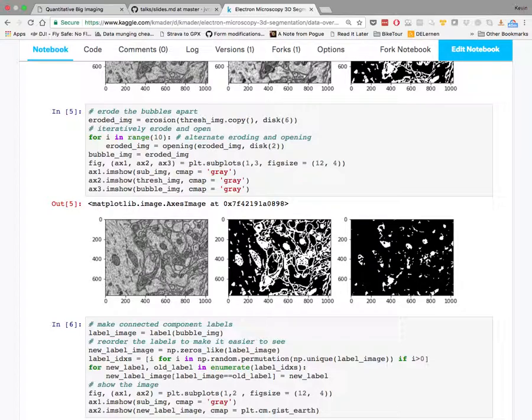But if you can break through a lot of those boundaries and do the morphological operations first, then you can do the component labeling and find the different regions and say things like, this is kind of round, this is a cell, this is very elongated and funny shaped, this is definitely not a cell. So that when your task is classifying these things as cells or not, it's much easier from these regions than it is from looking at a big giant clump.